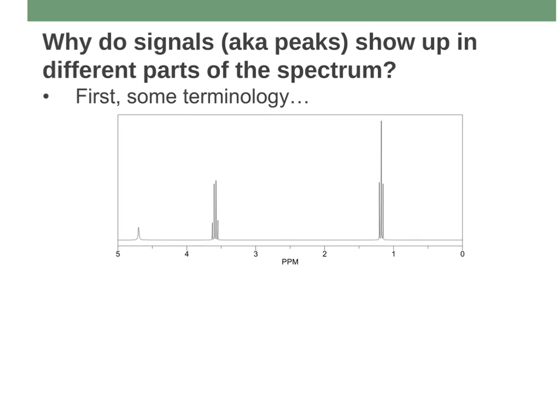Before we talk about that, we need to get a little bit of terminology under our belt. So here is your scale. I have from 0 to 5 in this case. Oftentimes you can see NMR peaks up to maybe 12, 13, sometimes 14, depending on what the molecule is. But we don't see things at like 20 and 30 and 40 very often at all, not for normal molecules. In this case, it only goes up to 5, that's fine. We refer to moving towards the right-hand side of this spectrum as being what we call upfield.